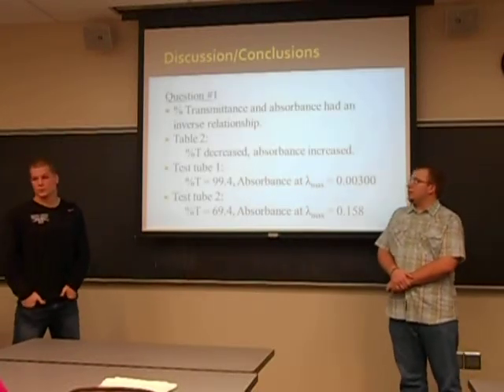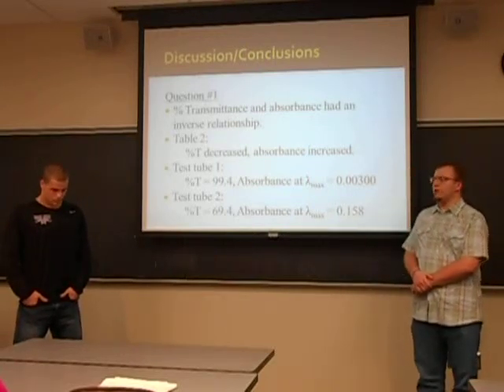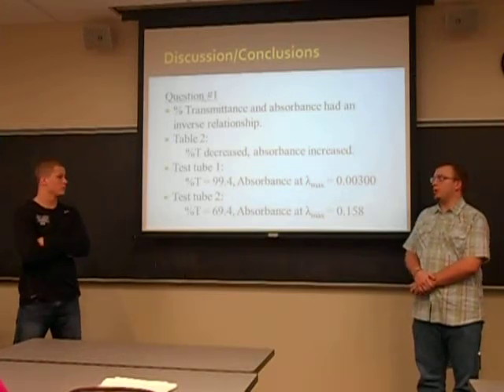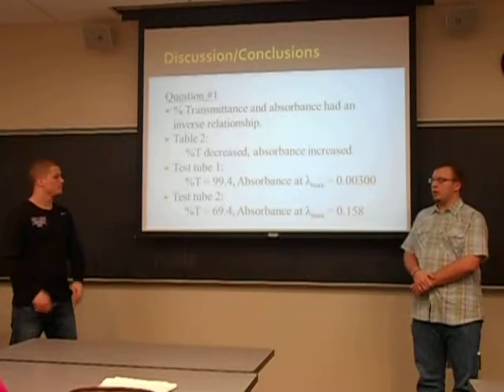For our discussion and conclusion, we determined that the percent transmittance and absorbance have an inverse relationship. This was shown in table 2. As percent transmittance decreased, the absorbance increased.